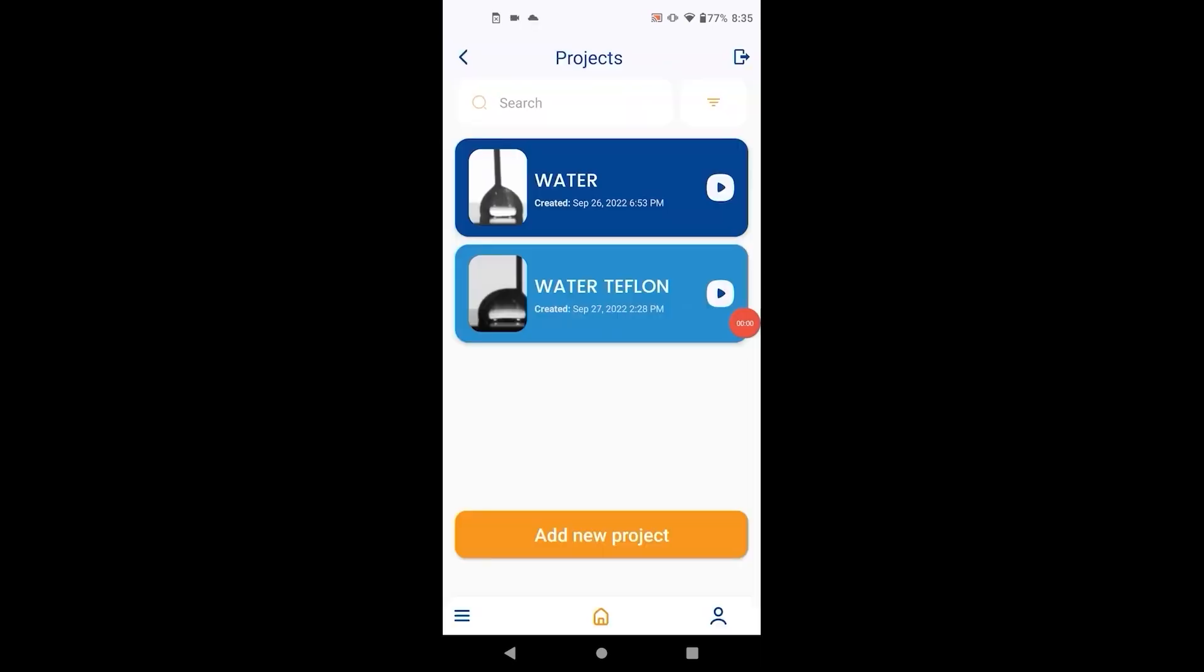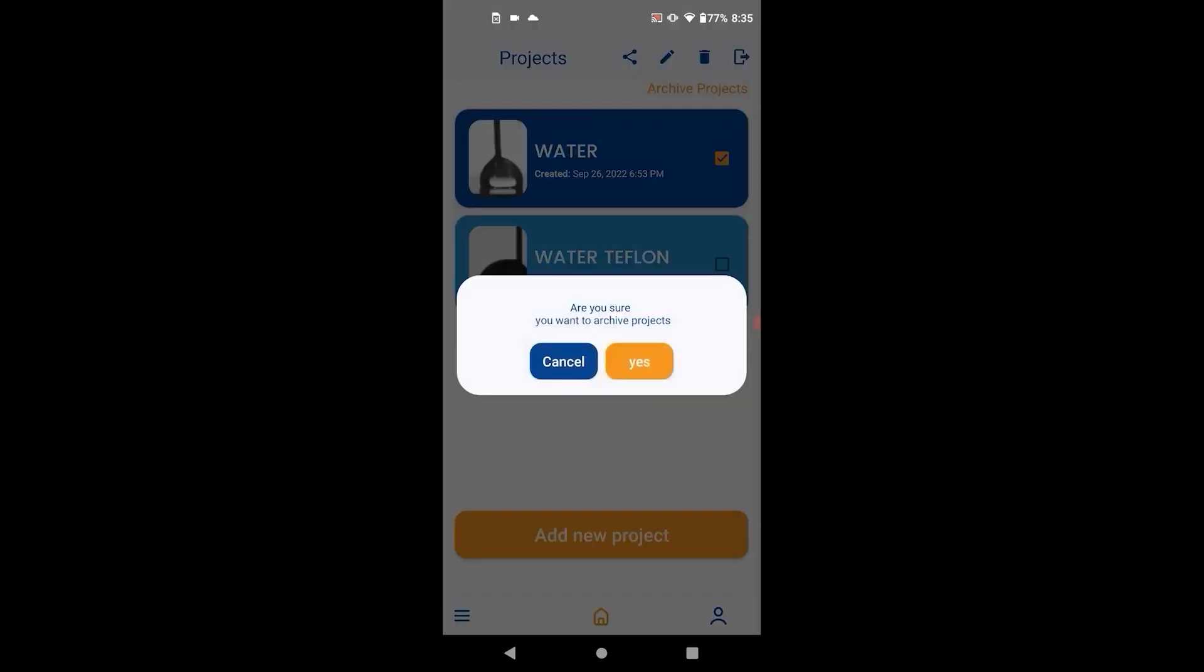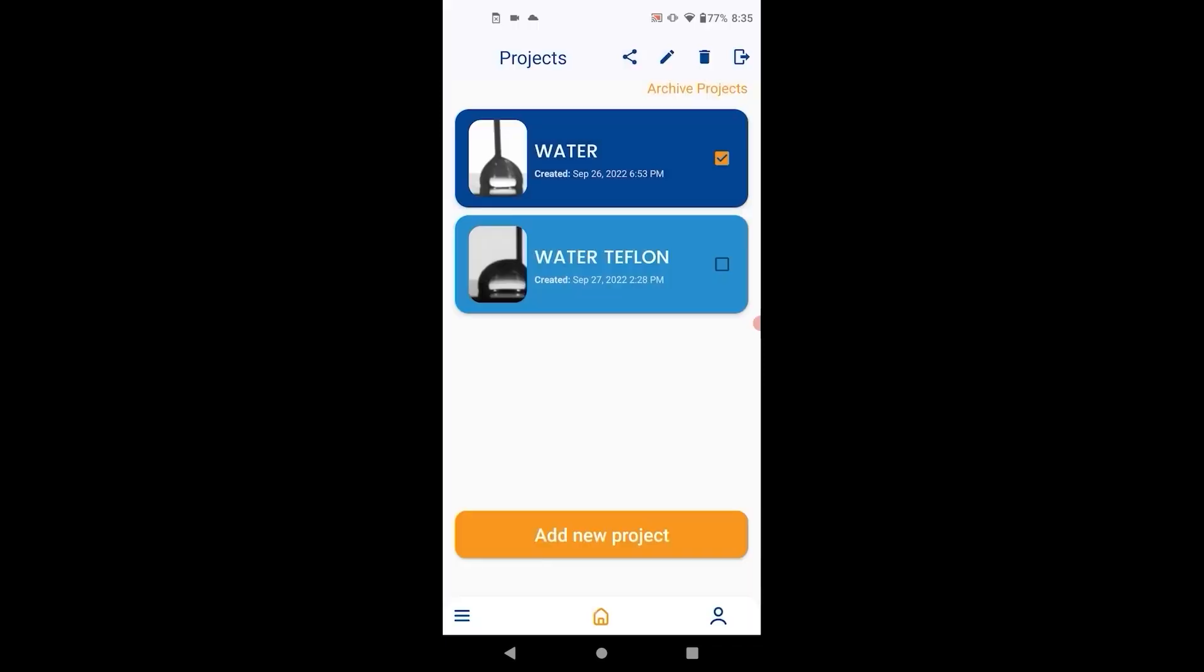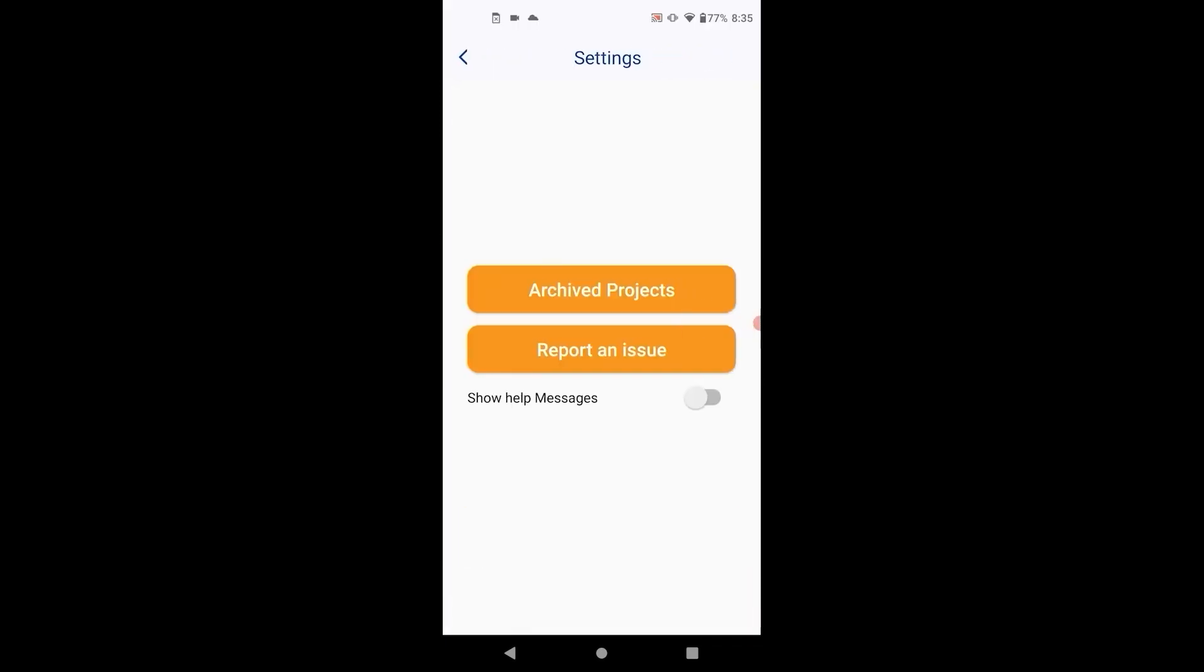The calculated data can be saved per your preference. In settings, you can choose if you want to store the data on the SD card. You can also choose to save on your preferred cloud service. We currently support Google Drive, Dropbox, Microsoft OneDrive and Box.